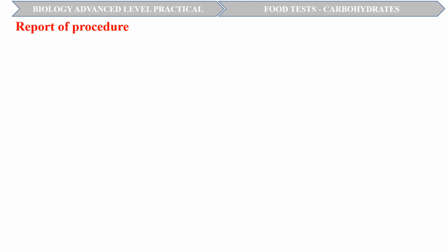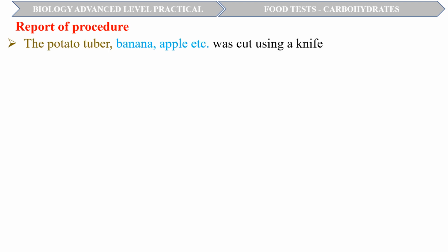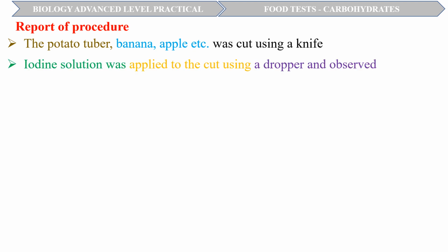A sample report of the procedure is: the potato tuber, banana, apple, etc., was cut into halves using a knife. Iodine solution was applied to the cut surface using a dropper and observed.